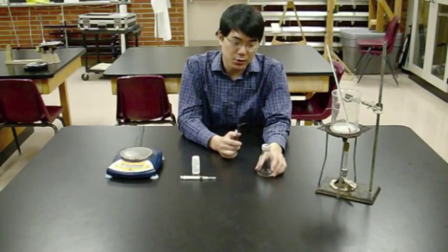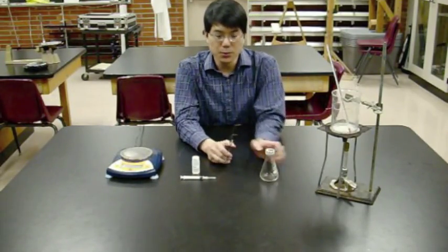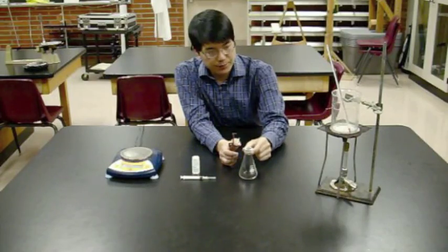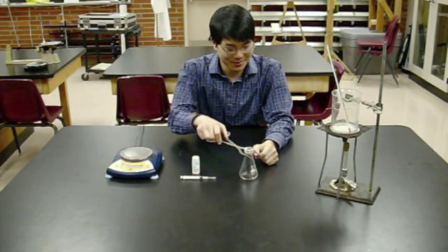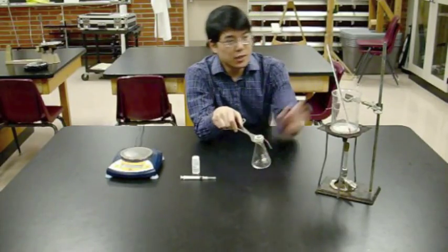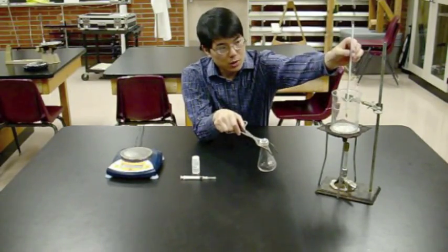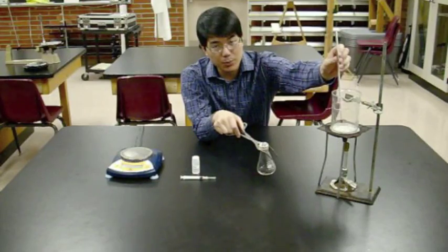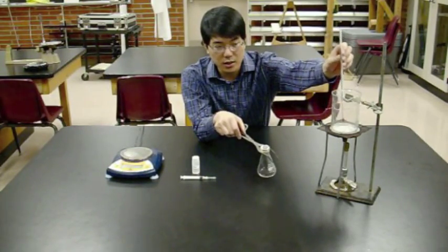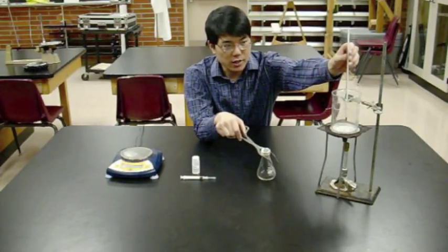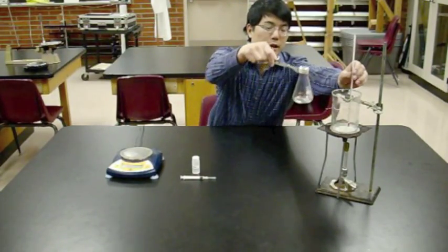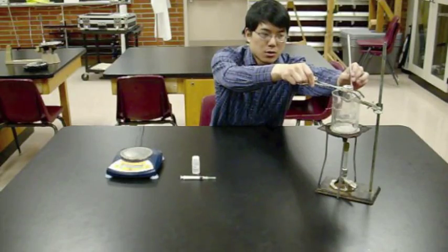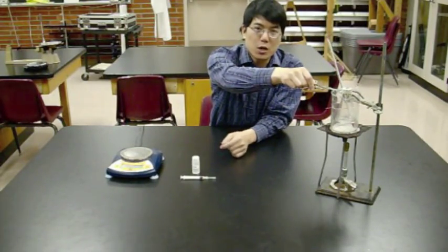Hold the Dumas tube with long forceps. Before you put it in the water bath, take a temperature measurement. Read your thermometer, making sure the end is not in direct contact with the bottom of the flask but is in the water. Take a temperature measurement, then put your Dumas tube into the beaker.